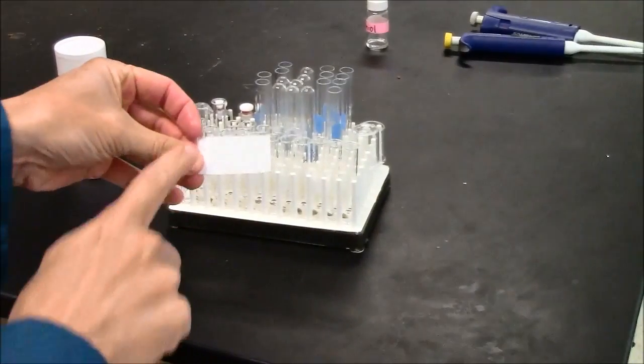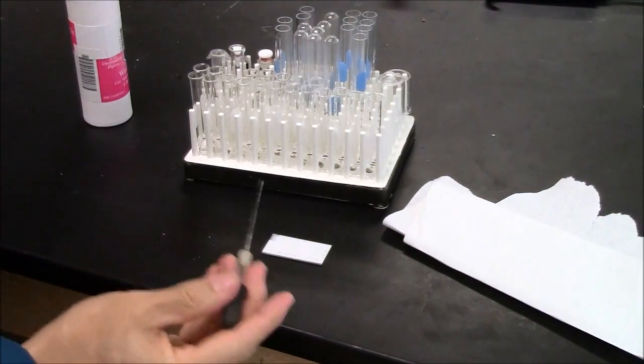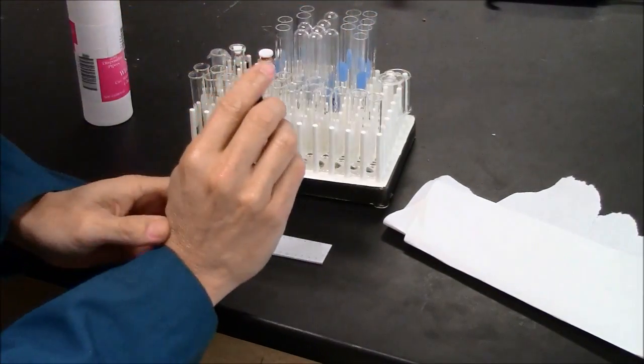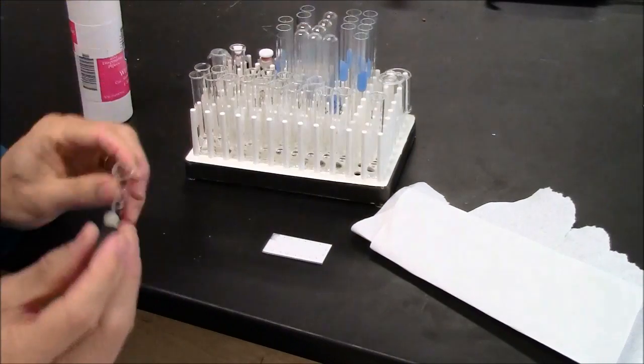On the plate I put numbers 1, 2, 3, 4, 5, 6, 7, 8 all the way up to 15. Here we go. I'm going to use 1 microcap, fraction number 1, get a little bit in the microcap, put a spot for fraction number 1, expel the remaining contents. So I'm getting rid of the remaining contents. Now I'm going to 2.